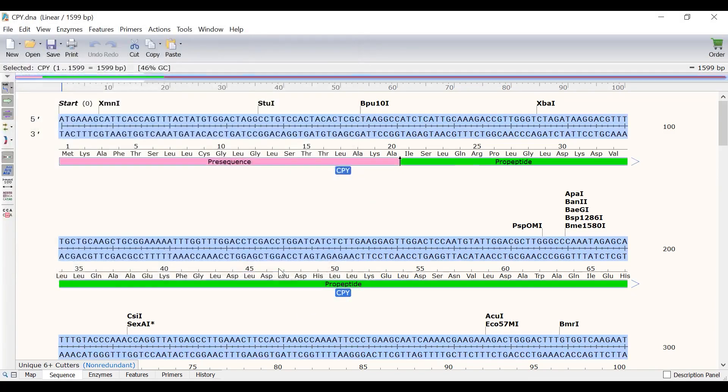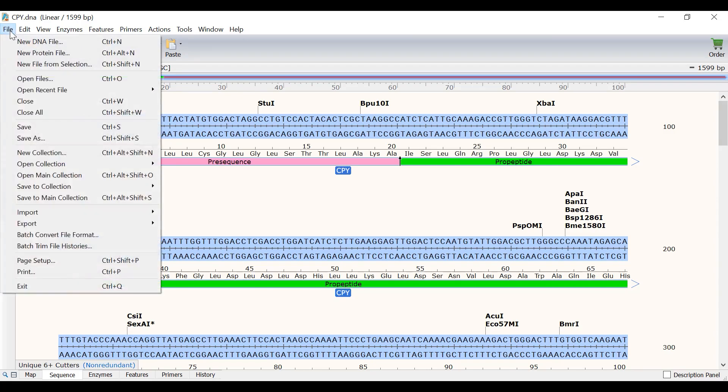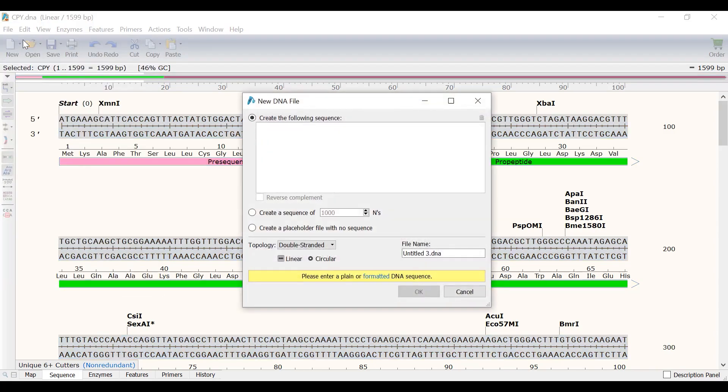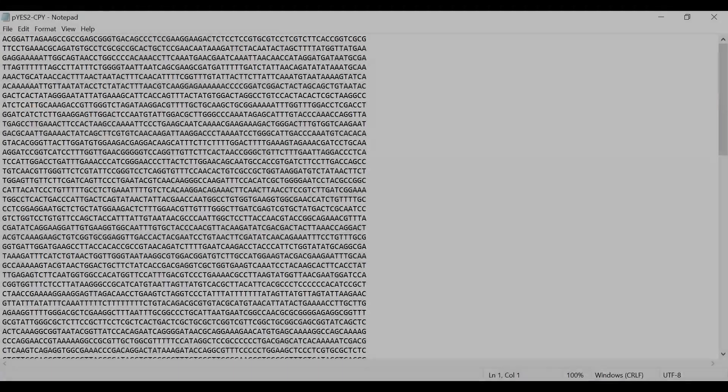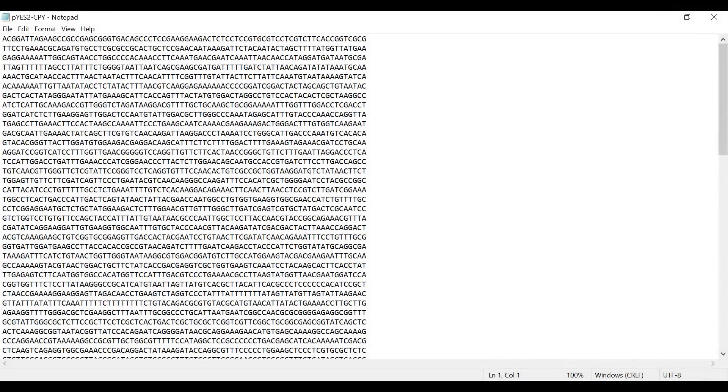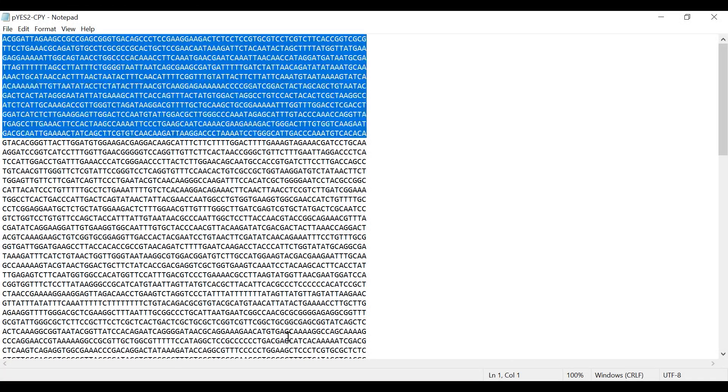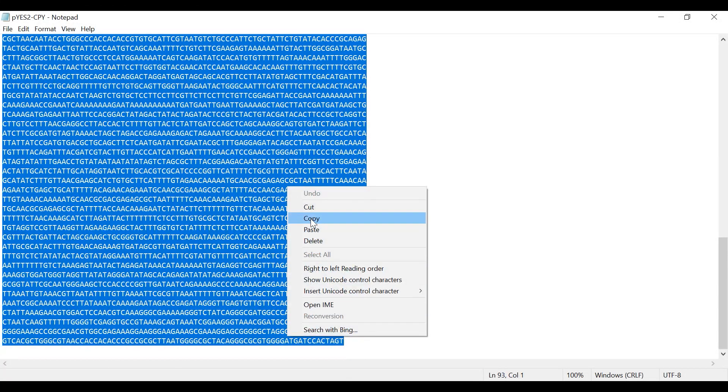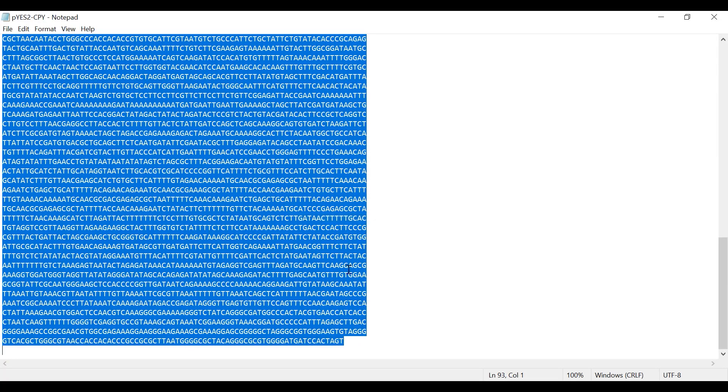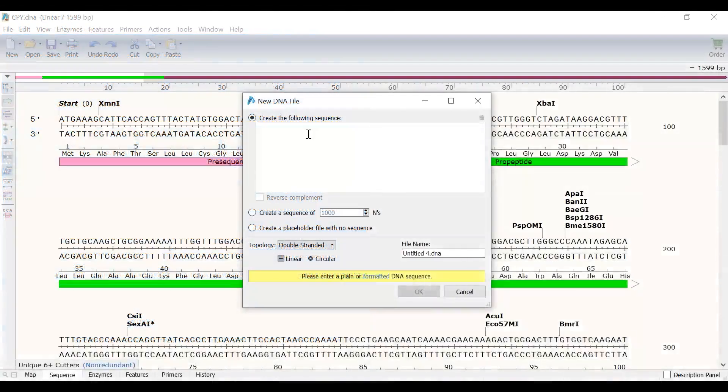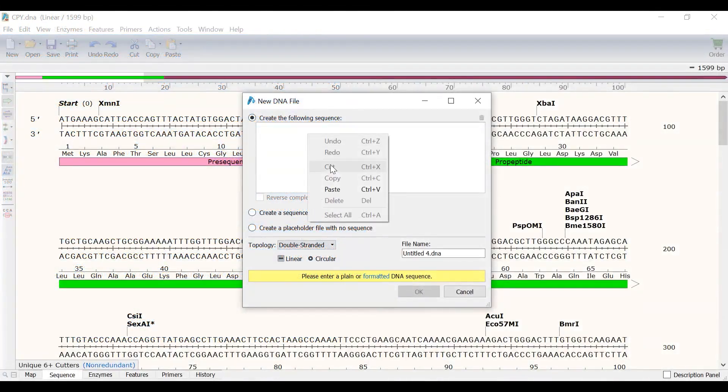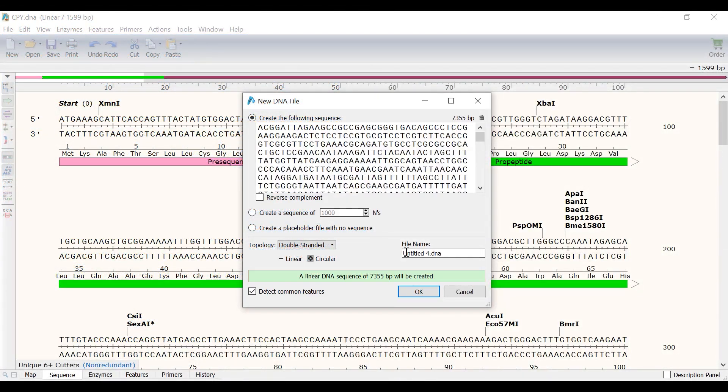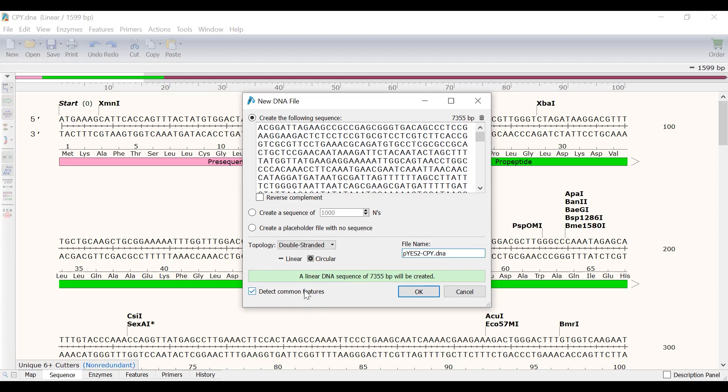To demonstrate automatic feature annotations and how custom features can be identified, I will create a new file by going to File, New DNA File. In a text file, I have the sequence for a plasmid pYES2 containing the CPY gene. I will copy this sequence and paste it into the Snapgene New DNA File window. I will call the file pYES2-CPY and will ensure the option to detect common features is checked. Then I will click OK.